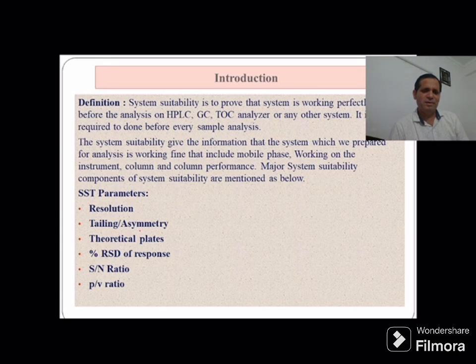Theoretical plate we also use there. Percentage RSD of the response means repeatability, meaning how our injector is working and whether the responses are reproducible or not.